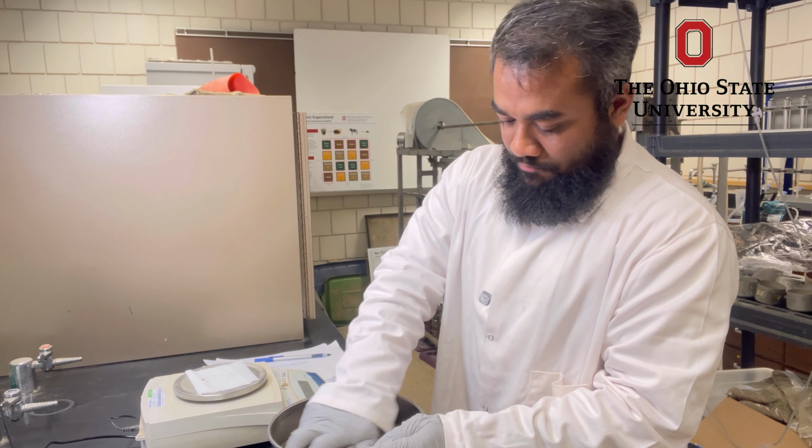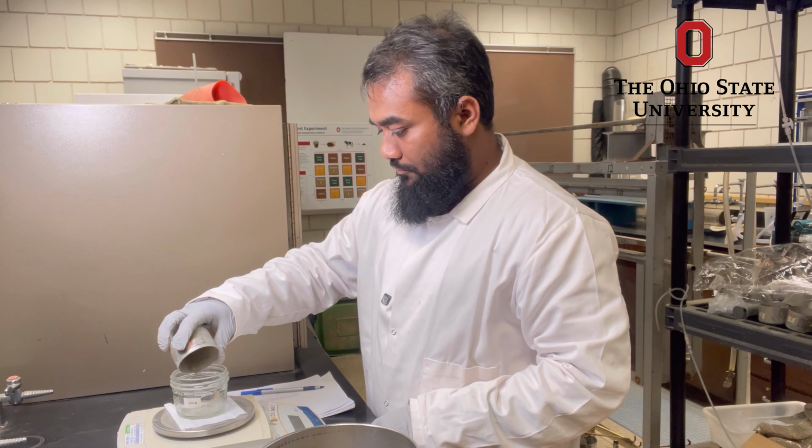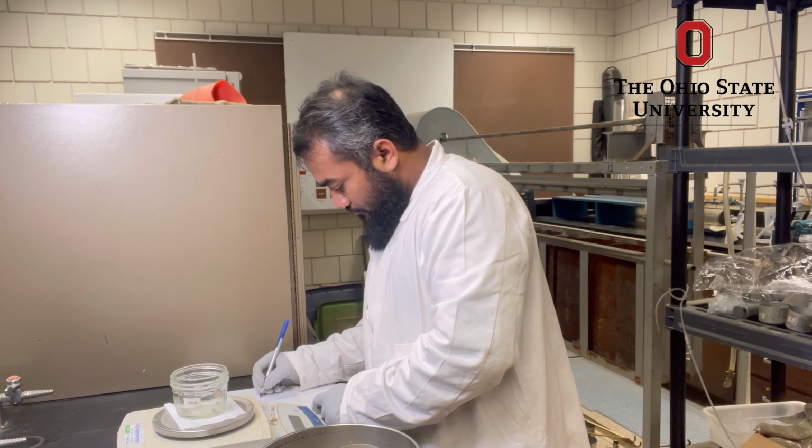After drying, the soil is passed through a 2 mm sieve. Material retained on the sieve is considered coarse fragments such as gravel. Step 6. Measuring coarse fragment mass. The coarse fragments are weighed separately to determine their dry mass contribution.